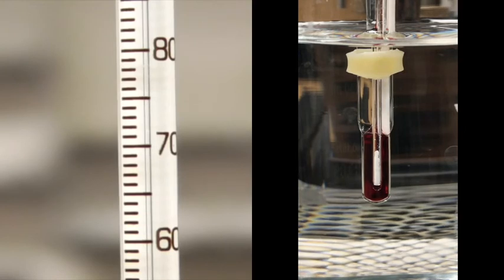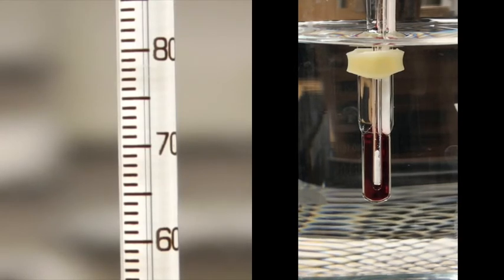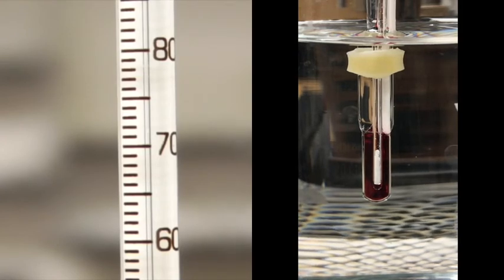Remember, we're doing a range here, so we're going to want to get the temperature when it first starts to melt, and you'll be able to see it when you see the crystals start to move around a little bit. And then we want to get the temperature when it's all melted. Also, remember the temperature we're reading to half a degree, right? So remember the thermometer, we're going to read 1 decimal, and that decimal is either going to be a 0 or a 5, depending if it's right on a line or near a line or between 2 lines. Okay? We're pushing up to about 40 here, so we're getting there.